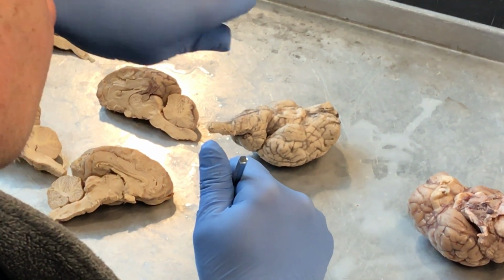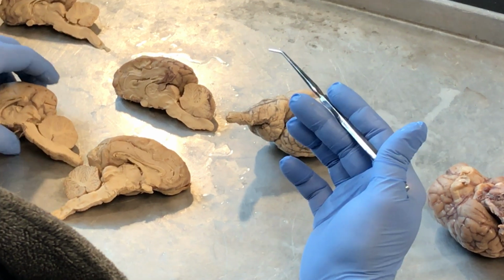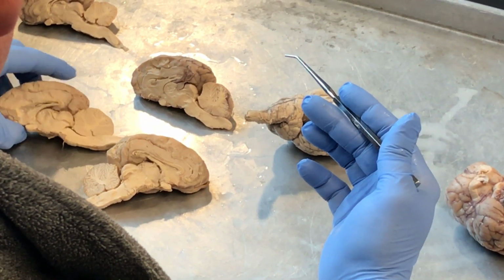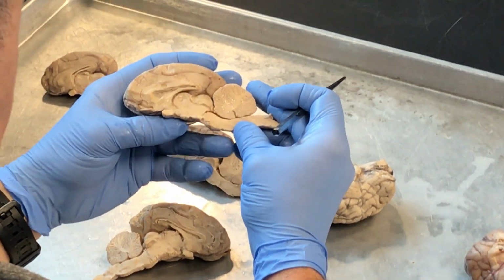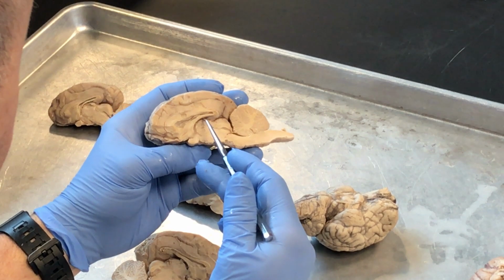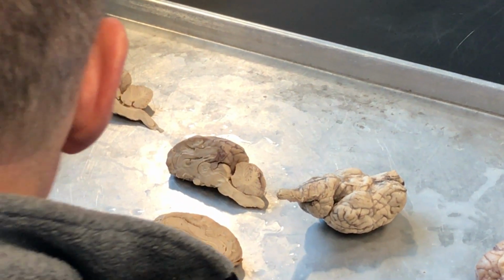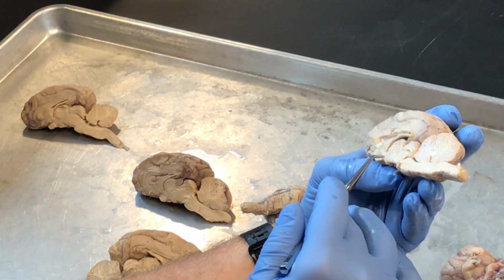Cerebral aqueduct. An aqueduct carries water from one area to the next. Farmers use aqueducts. They still use them today. So where's the cerebral aqueduct? Well, remember where our third ventricle was located. This one's probably pretty good. Third ventricle, there's the intermediate mass, there's the optic chiasm, third ventricle right there. Third ventricle in this space.